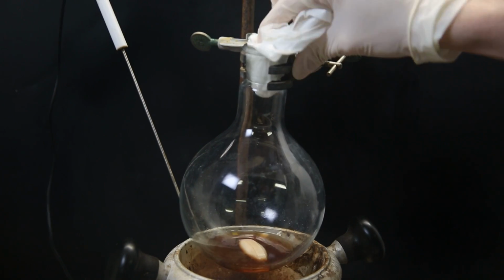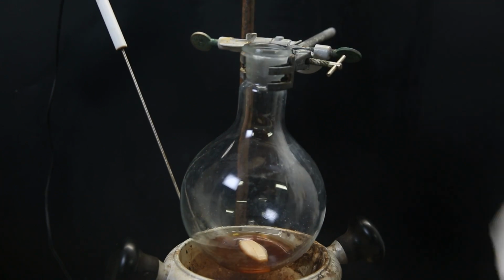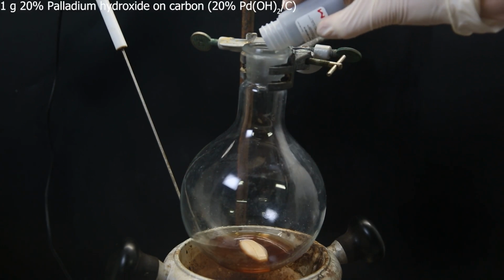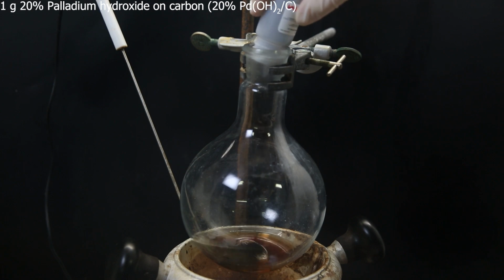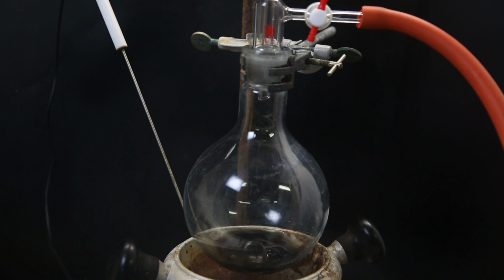I quickly clean the neck with a paper towel to remove the grease, to prevent some of the catalyst from getting stuck there. I then add 1 gram of 20% palladium hydroxide on carbon as the hydrogenation catalyst, which is the whole bottle. I then reattach the adapter and attach a balloon filled with hydrogen to the upper connection.